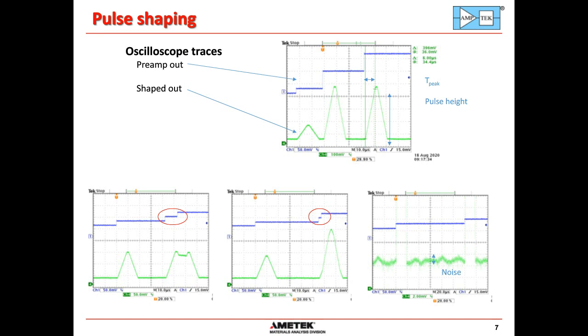If you are not running it at full cooling, so if there's reduced current through the Peltier cooler, then it does not cool as much. That temperature difference drops from 85 to 75, 60, 50, depending upon how you set that. The 240 Kelvin that I referred to is the measured temperature of the detector itself.